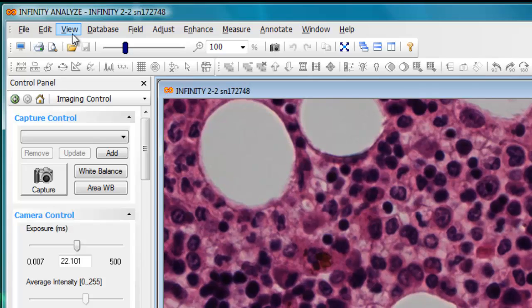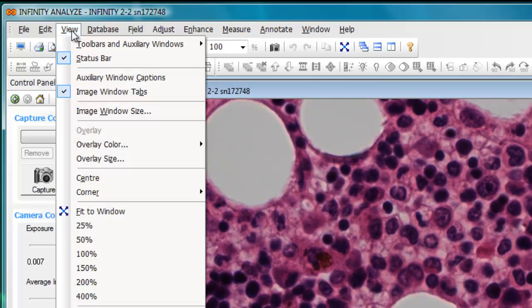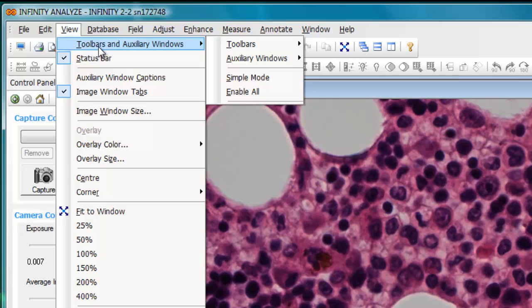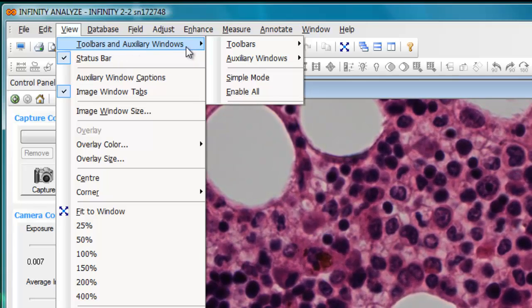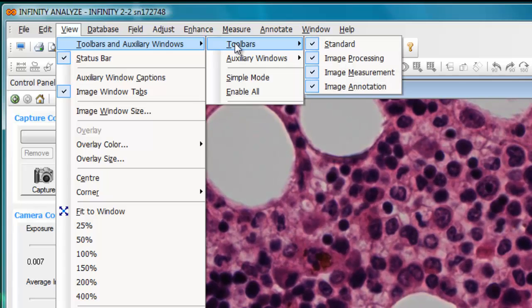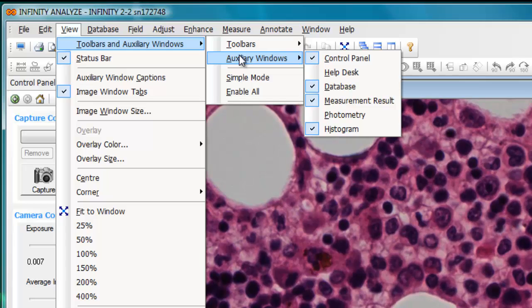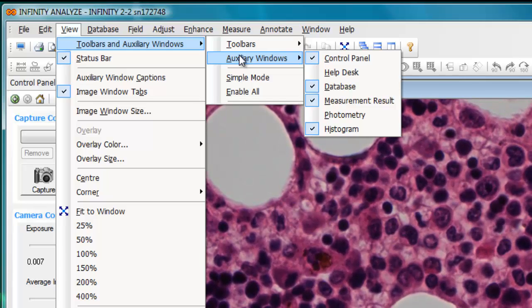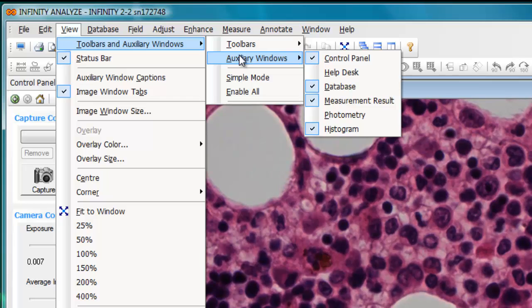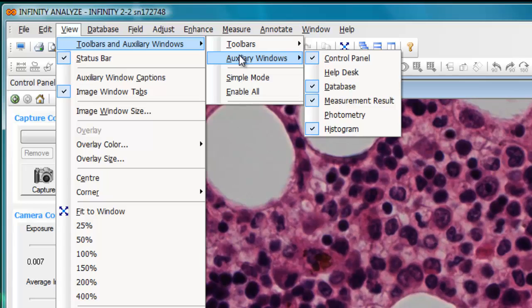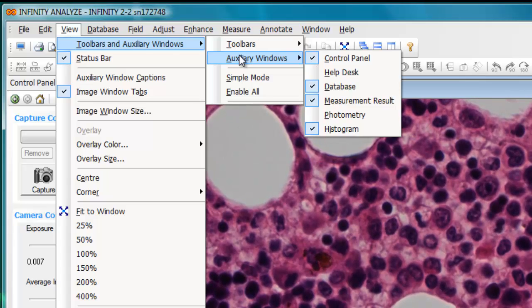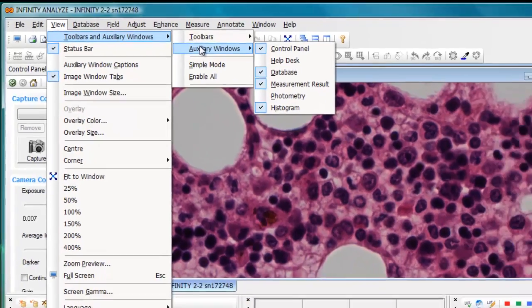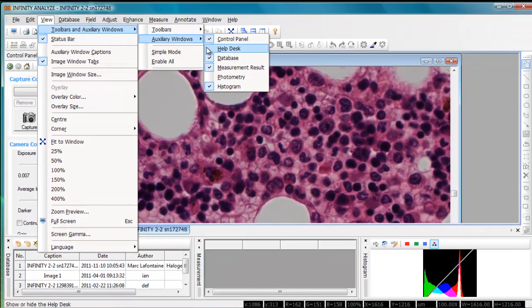The other place that the access to the layout is available is under the view menu where we have toolbars and auxiliary windows. The fly-out menu shows all the windows, most of them turned on with the exception of helpdesk and photometry. The downside of this approach is that each item can only be selected with one drop-down access of the menus. So you have to keep returning to this menu structure to enable the specific item.